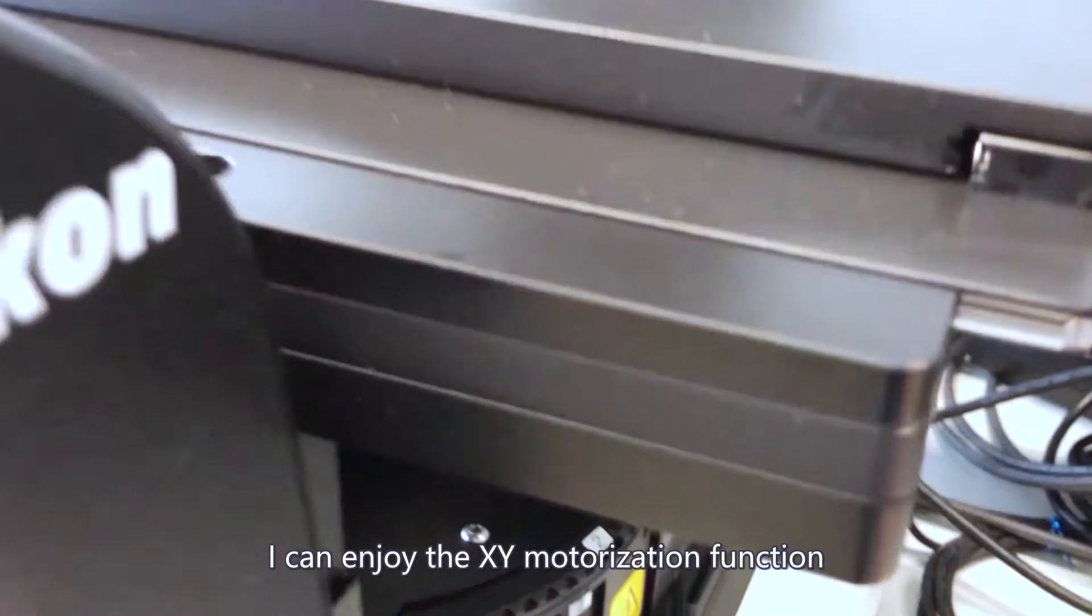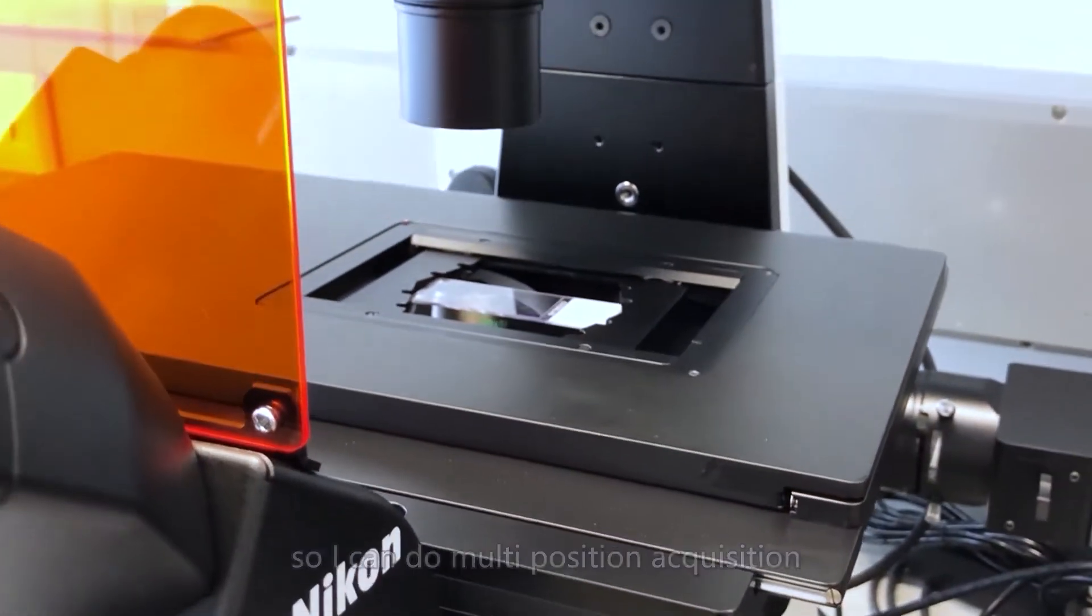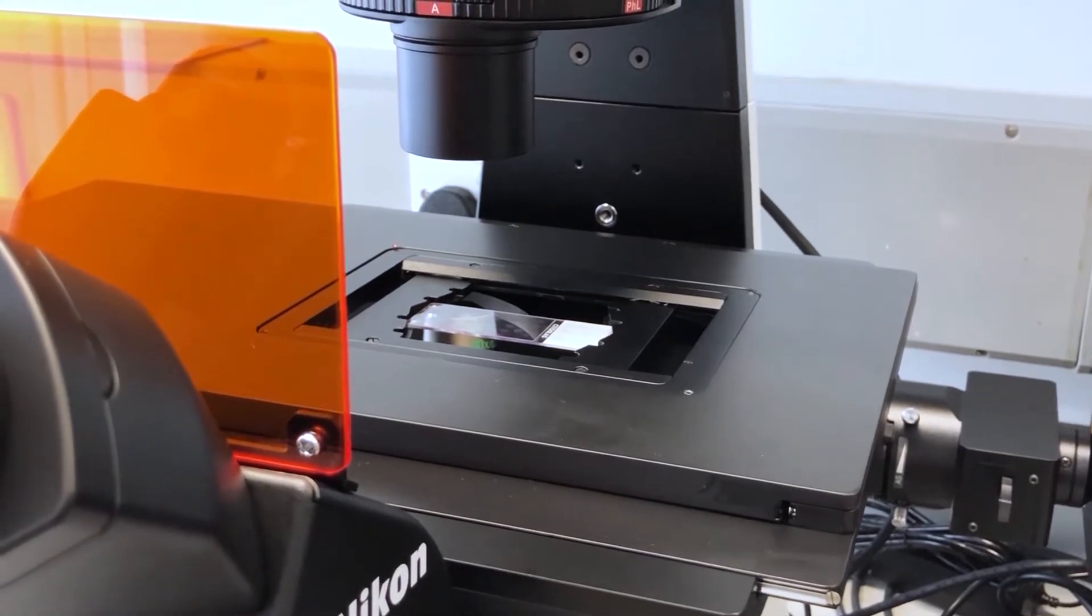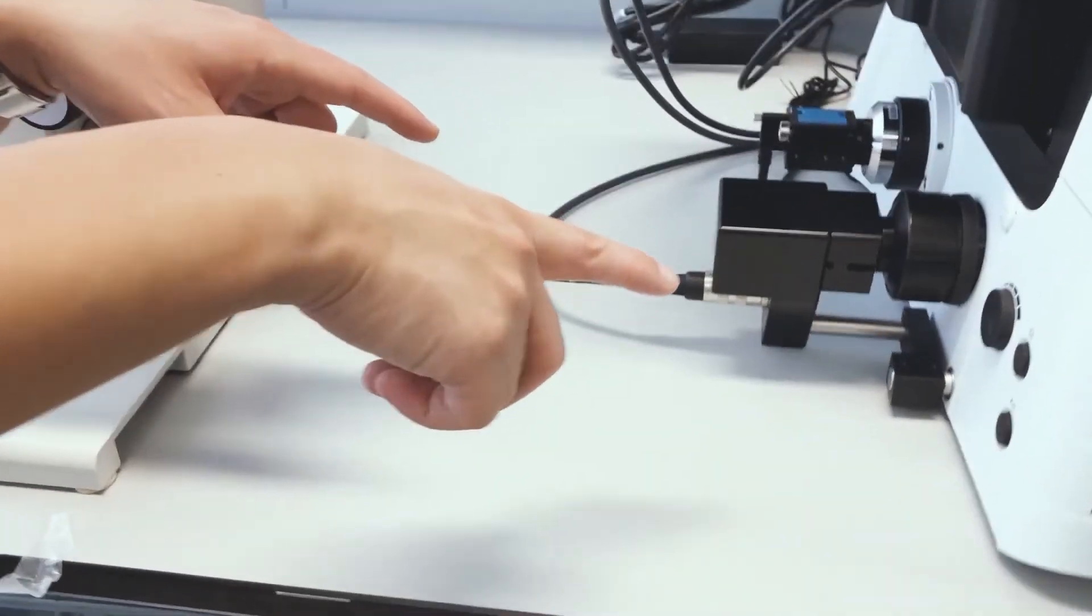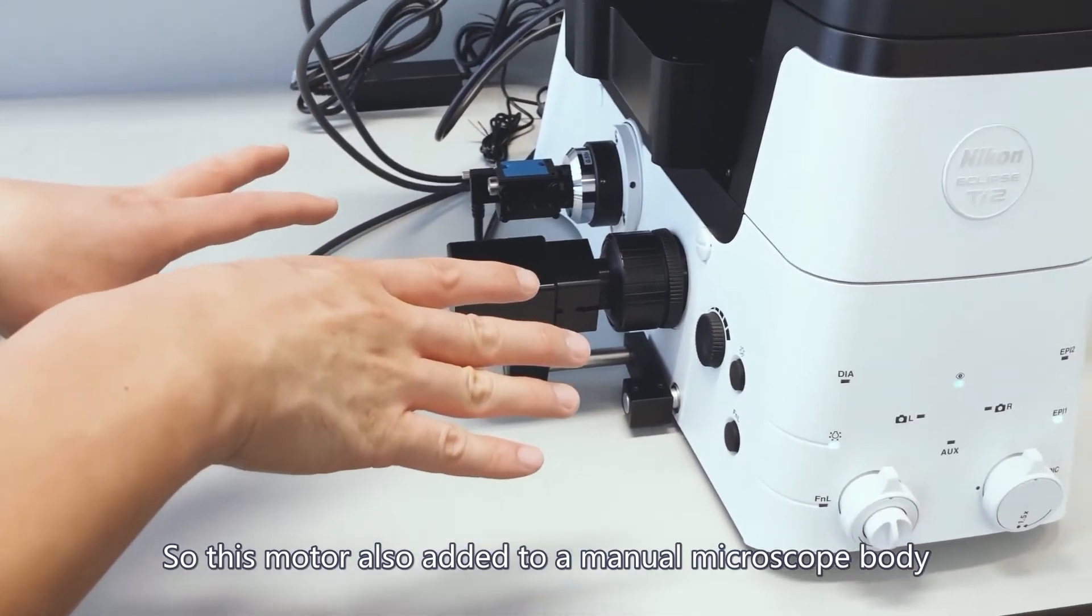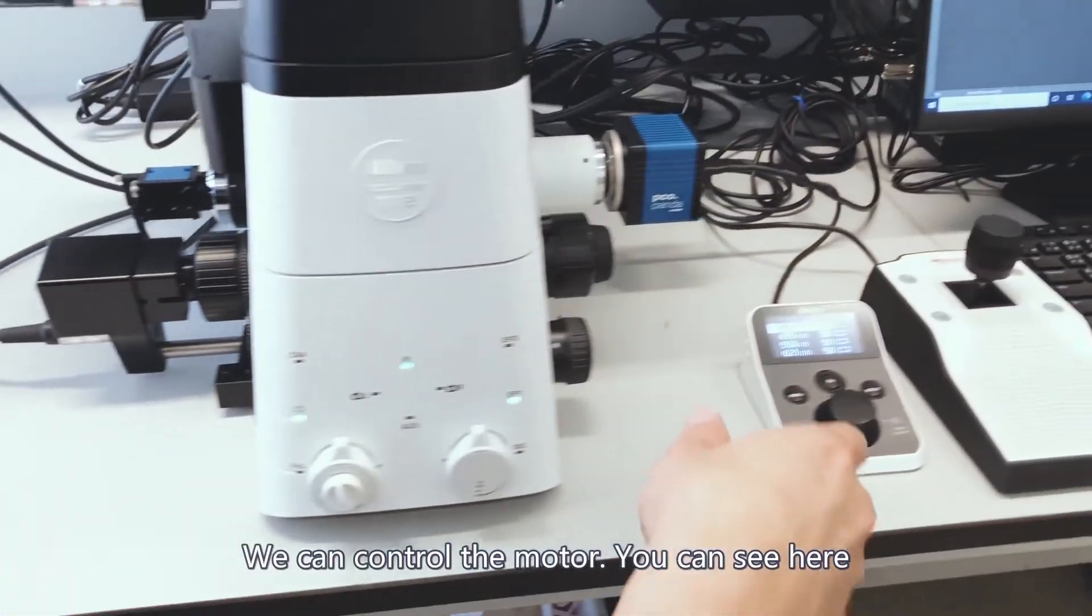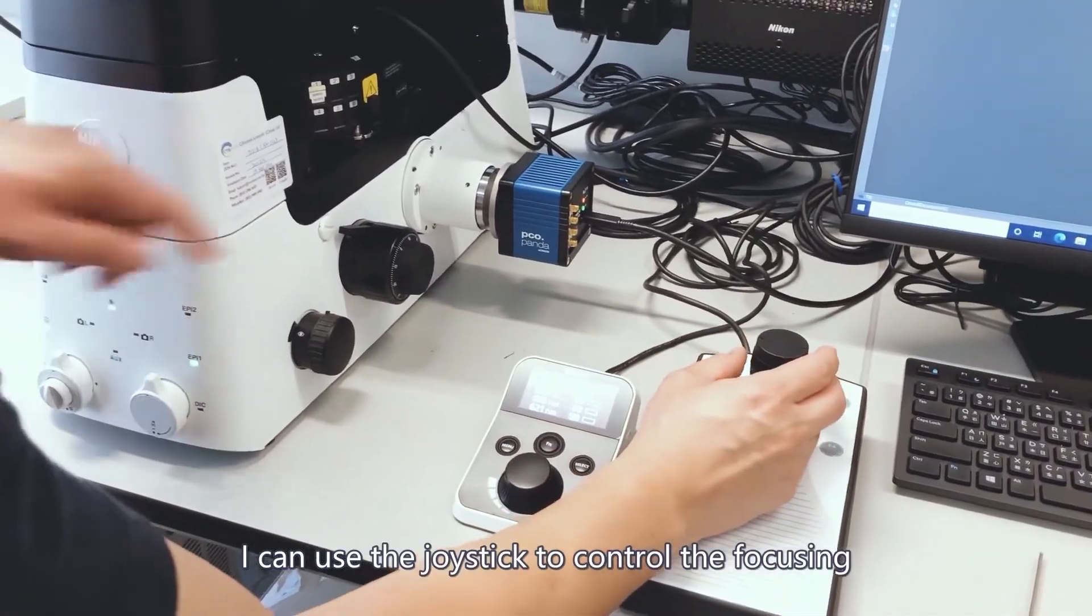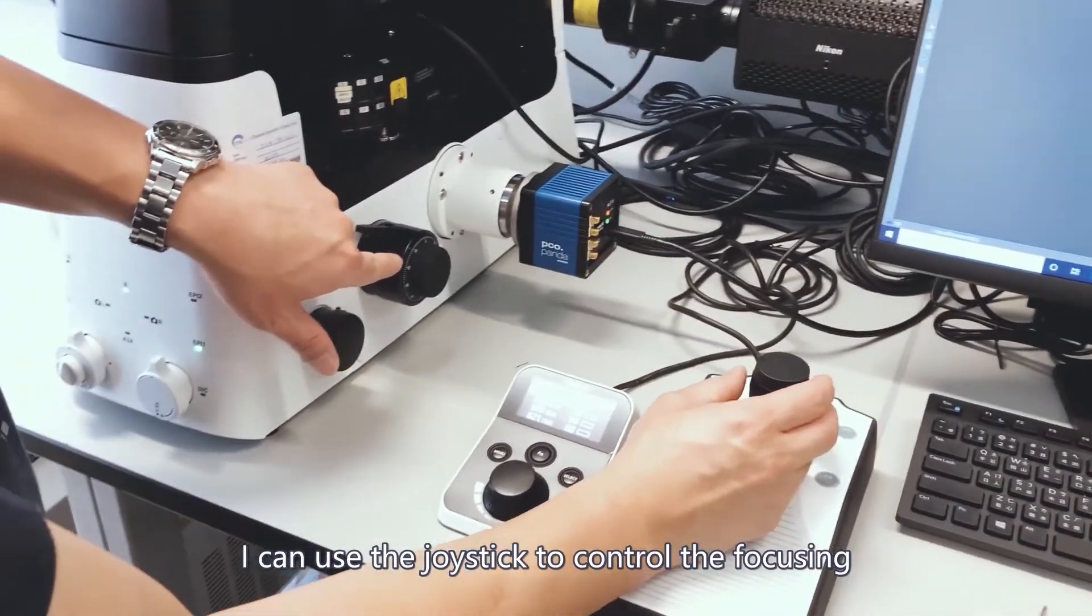And I also added an external Z motor. So this motor is also added to the manual microscope body. We can control the motor. You can see here. I can use the joystick to control the focusing.